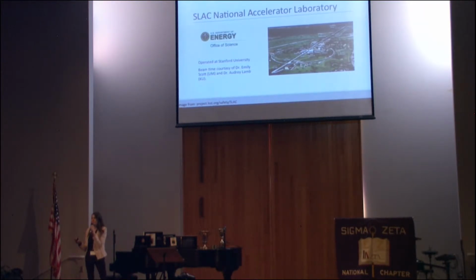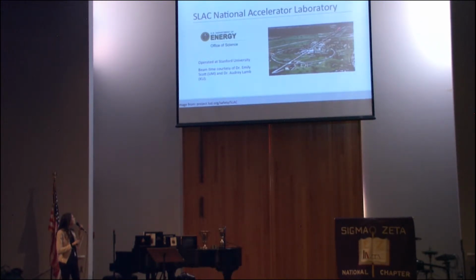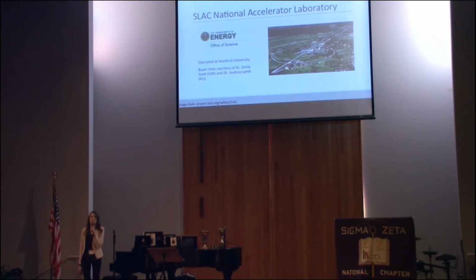So we were able to watch this online and actually get to do it, which was pretty awesome. Our crystals were located in this linear beam. This is where our accelerator was, and so that was really cool. And I also want to acknowledge Dr. Emily Scott and Dr. Audrey Lamb, who gave us beam time and made it possible to do this.